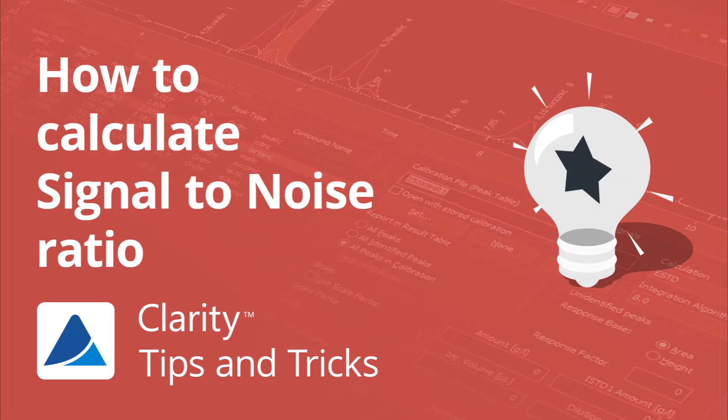Hello, in this video, I will show you how to calculate the signal-to-noise ratio in Clarity.